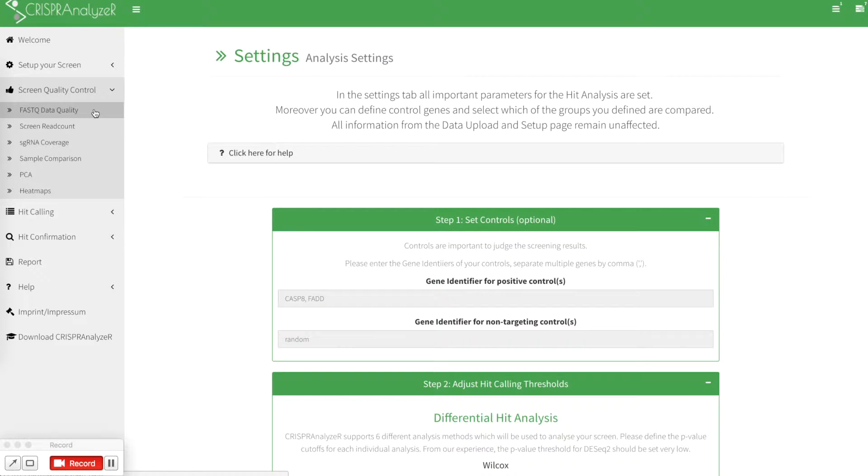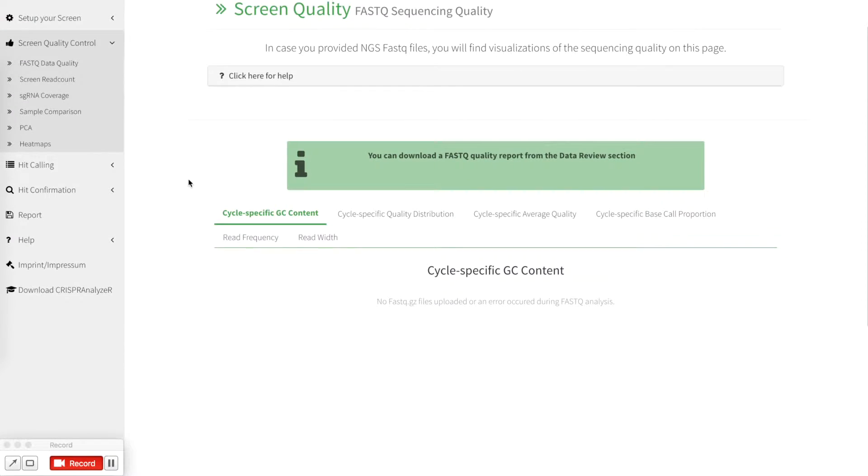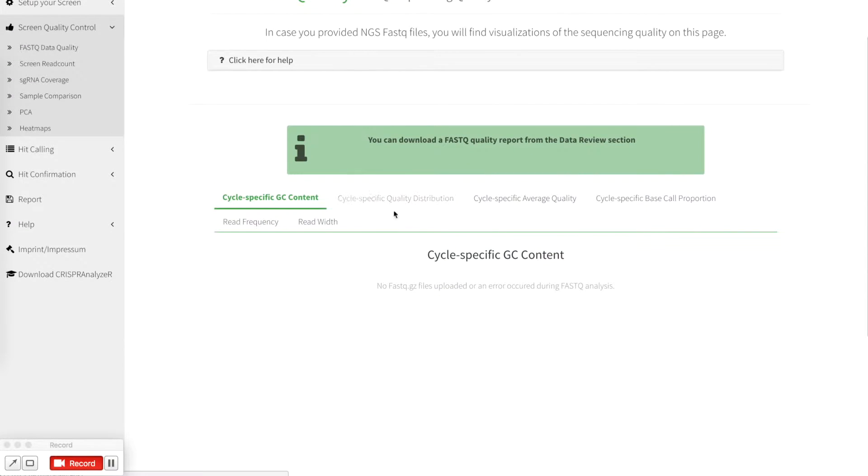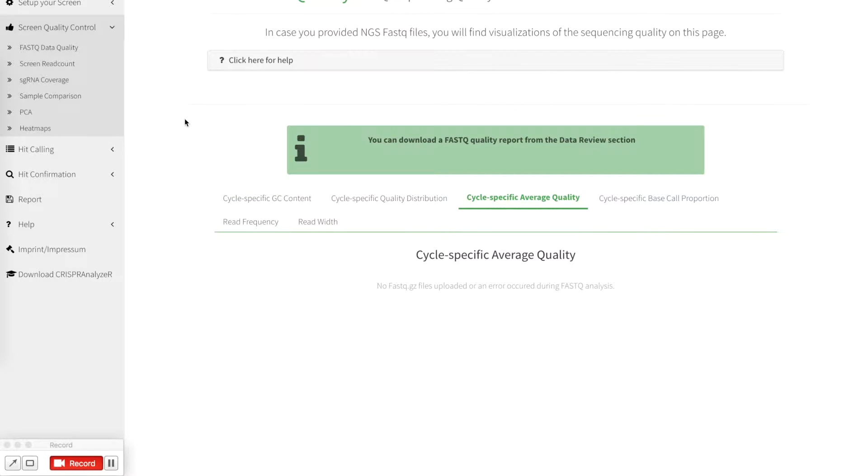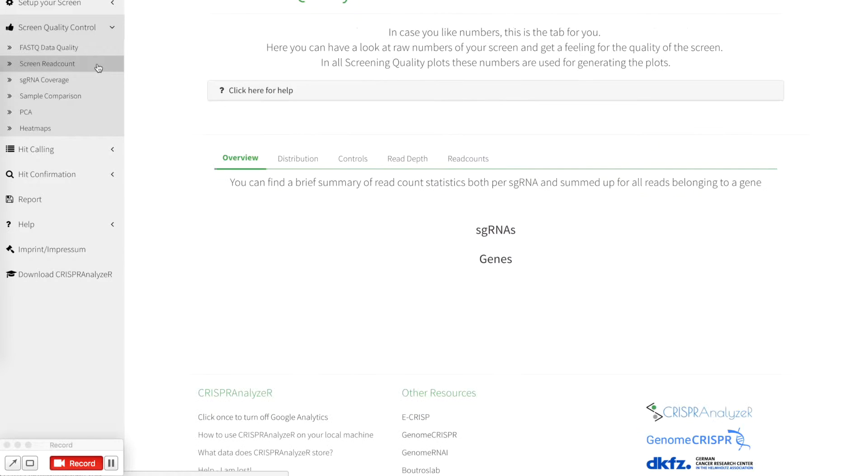We go on with the FastQ data quality and the first thing that you notice is that when you upload a read count data, of course no FastQ quality information is present. So let's go on with the screen read count.